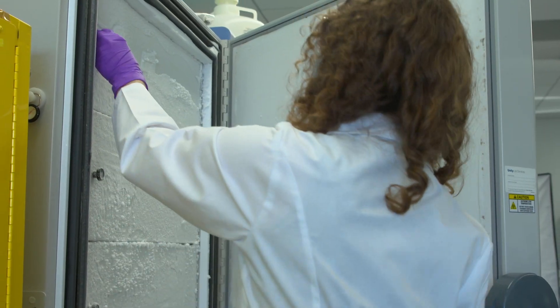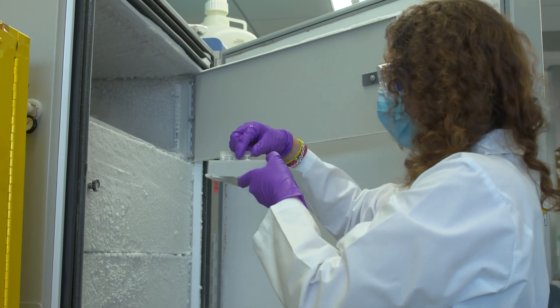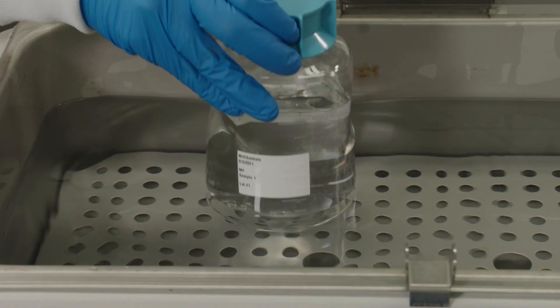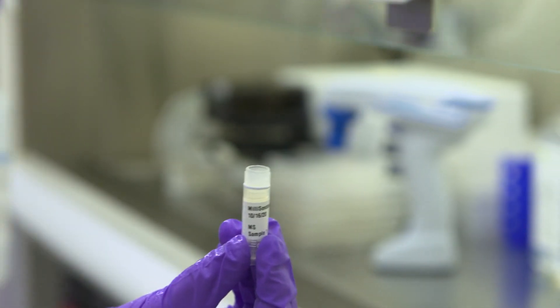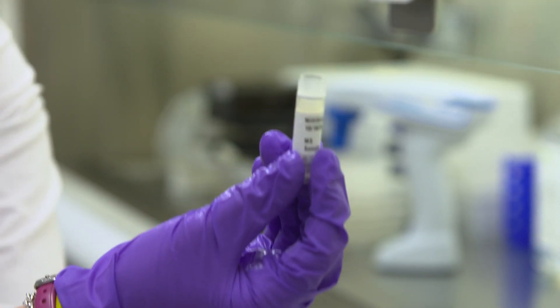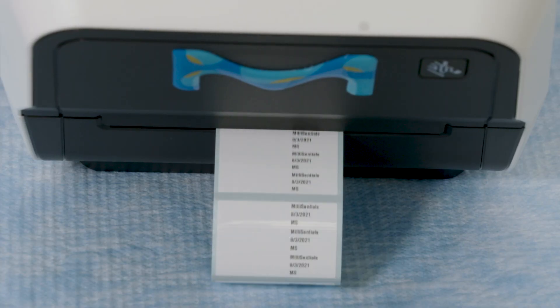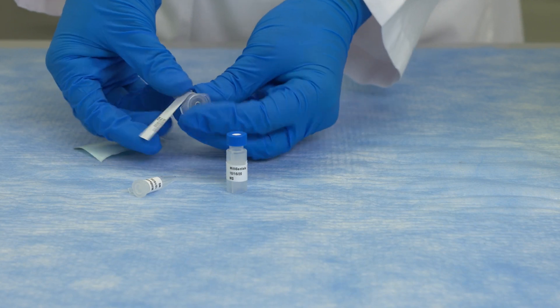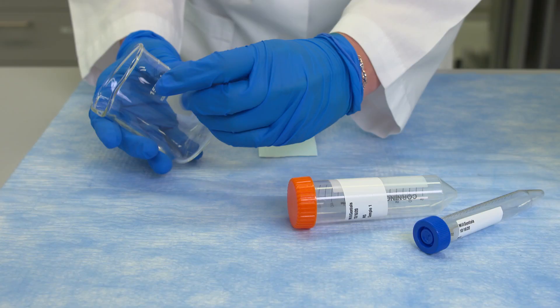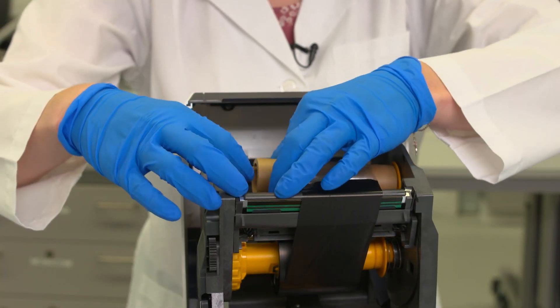The labels can withstand temperatures from negative 196 degrees Celsius to 100 degrees Celsius, immersion in water, and exposure to harsh chemical solvents such as ethanol, DMSO, xylene, and bleach. Additionally, the labels have been designed with two custom perforations that allow the label to adapt to different vessel sizes.